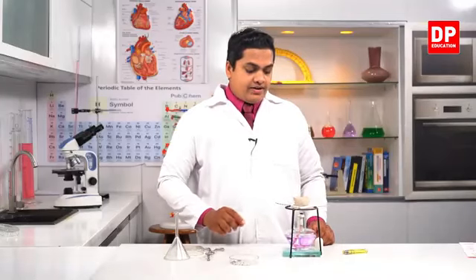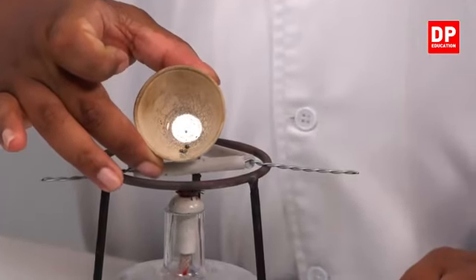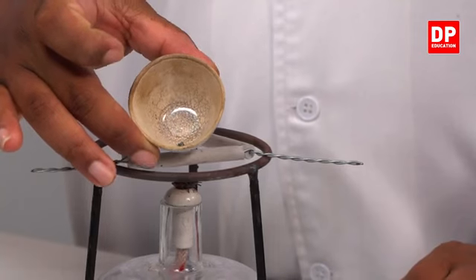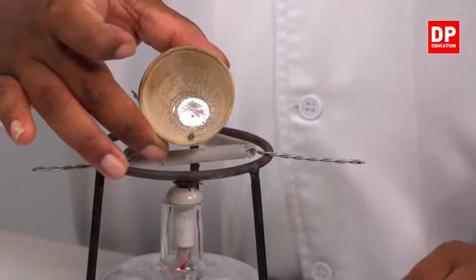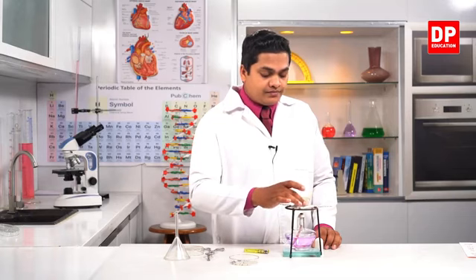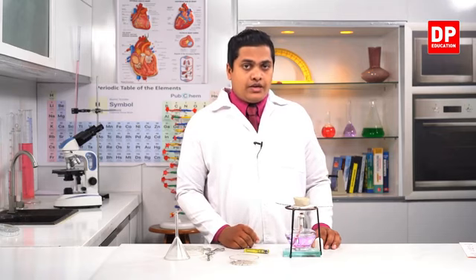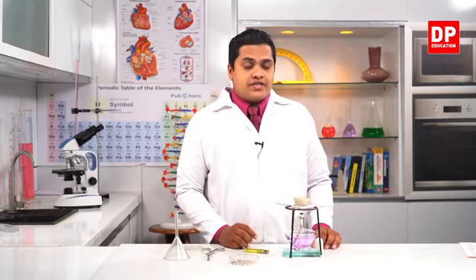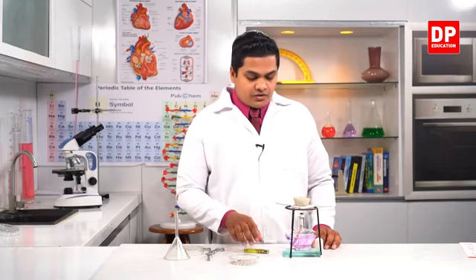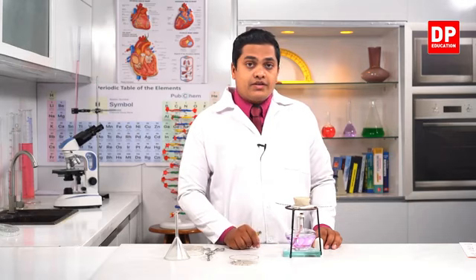Right, so I have added some iodine into the crucible. I have added a few pieces of iodine crystals here, right? So I'm going to keep it and heat the system to see what will happen in the state change. So we'll heat it up and see whether this iodine will turn into a liquid or not.